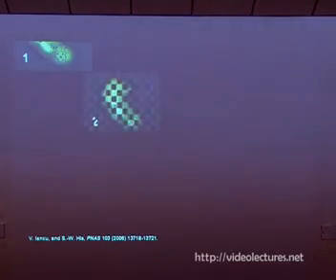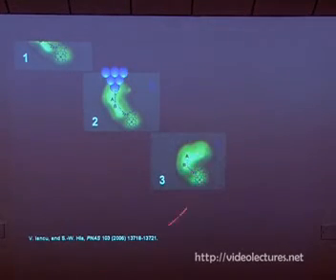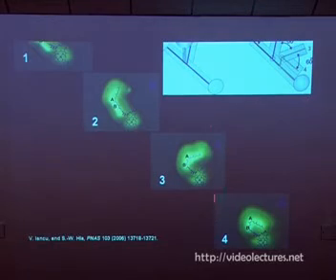We start with a single molecule. I'm sorry again, my picture is cut off here. And we inject the tunneling electrons. We can change to these structures. And if we inject electrons again at B, we can change to this structure. And if we inject at A again, we can change to these structures. So what's happening here is that we are changing the conformation of the molecule each time, using a 60-degree tail bending between each structure, between 1, 2, 3, and 4. And we can control it.